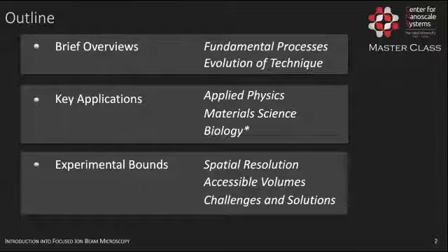I will particularly focus in this talk on biological applications because they are now the new frontier for that method. As with every technique, focused ion beam has its challenges, and you need to be aware of those in order to properly evaluate whether and how they affect your results. For most of them we do have mitigation strategies, and I will talk about that. I hope in the end that you have a sense of the scope of the technique, so that you can decide whether it might be of use to you.